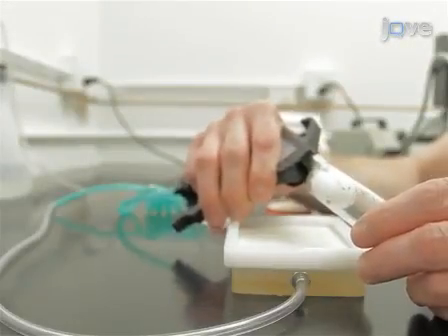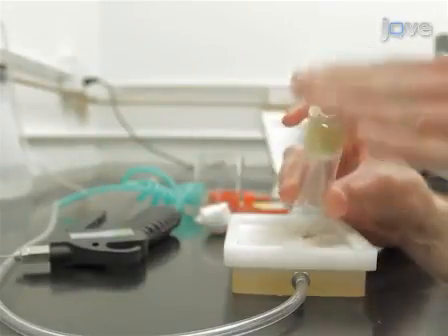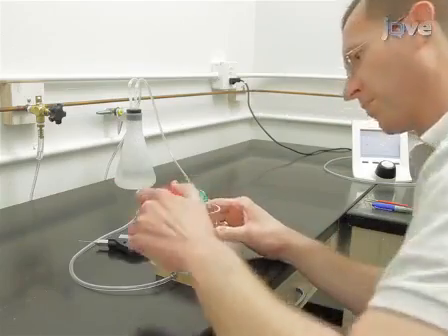Move a population of flies into a mating chamber, and then collect eggs every 24 hours for 3 days, ultimately creating 3 age cohorts.